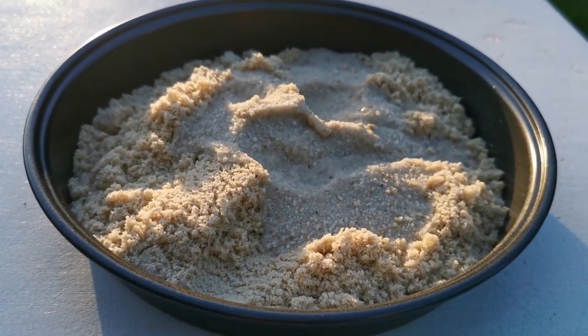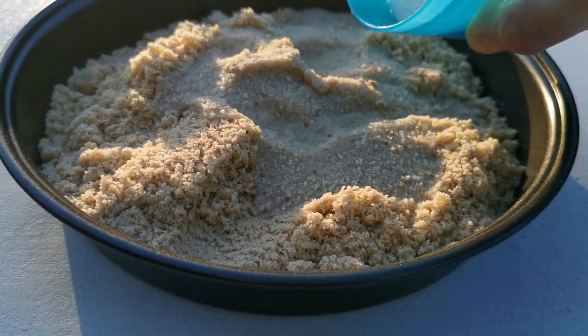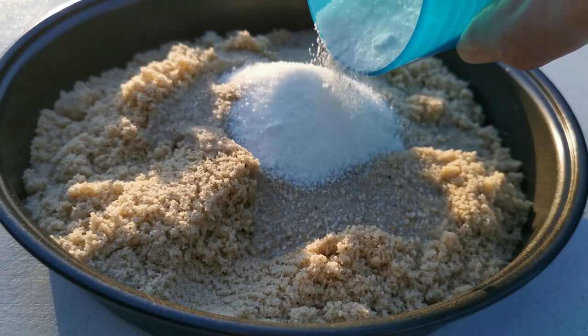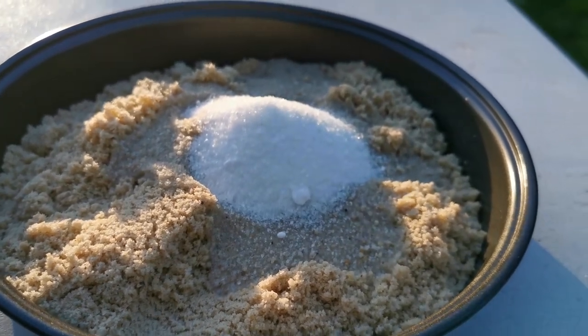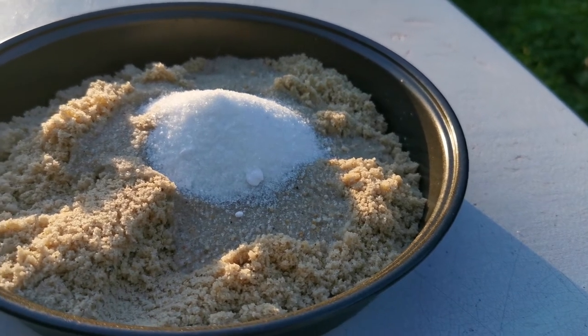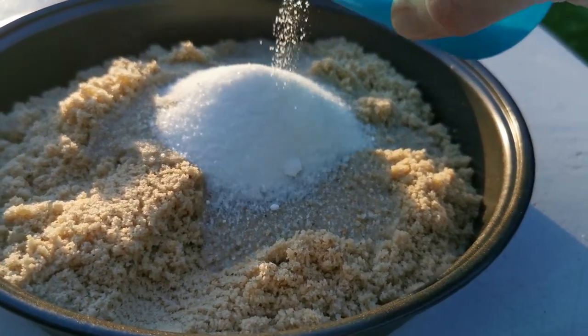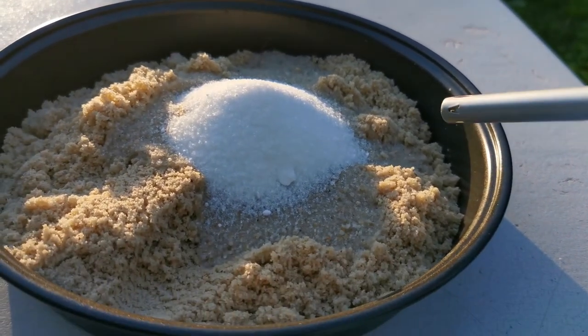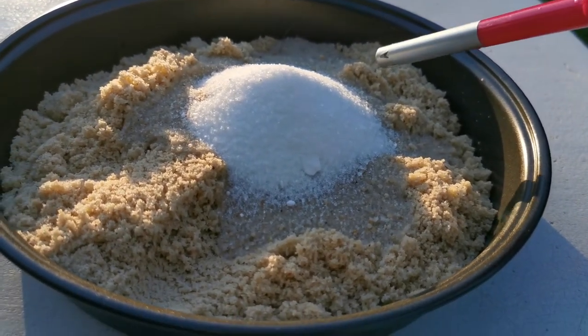For this second try I've put the ethanol onto the sand first and then I'll put the sugar and bicarbonate mixture on top of that. Let's see if we get a different result this time, maybe a bit more... Hopefully this will work a little bit better.